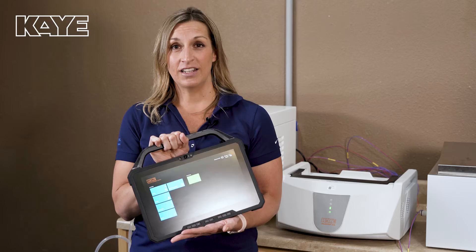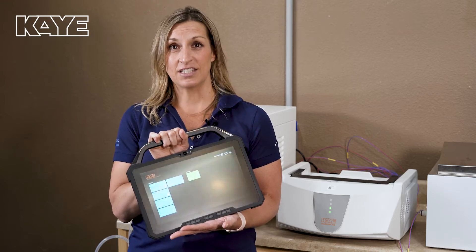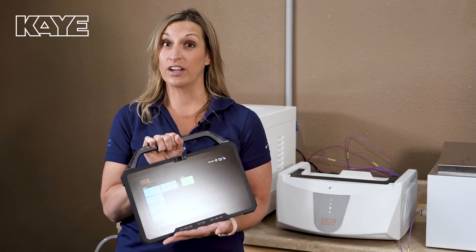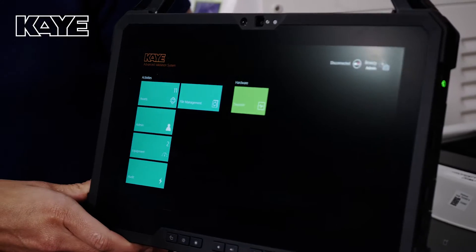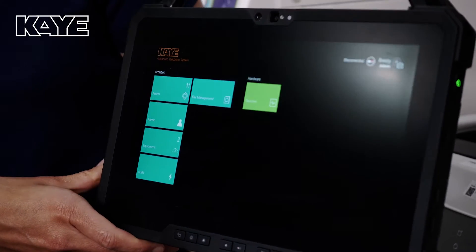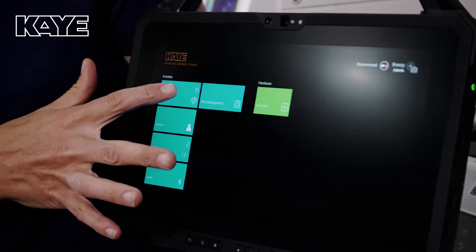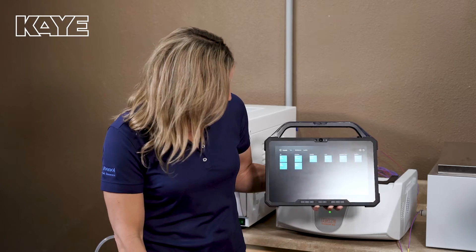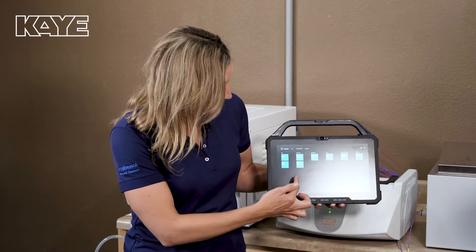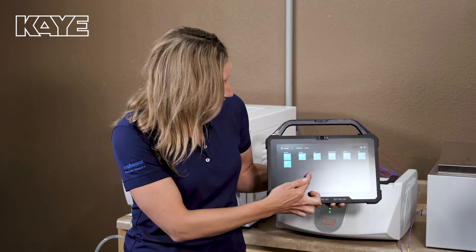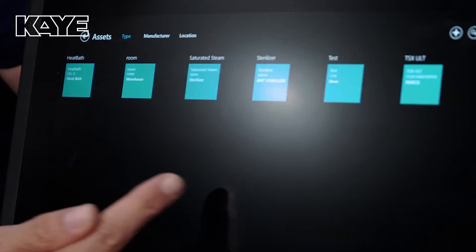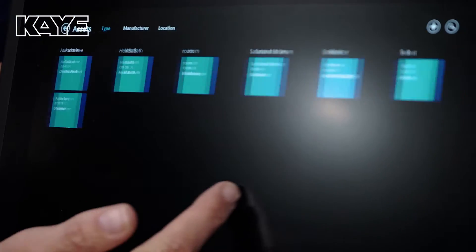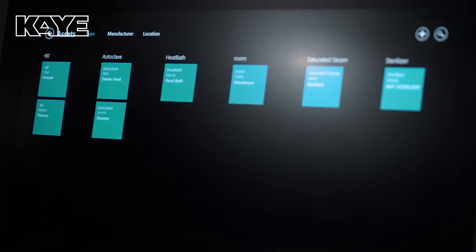We now have this asset management concept that makes validating your assets year over year very easy. As you can see in the software here, I have an asset tile. When I click on the asset tile, it's going to give me a list of every asset that I need to do a validation for, or that I've done a validation for in the past.